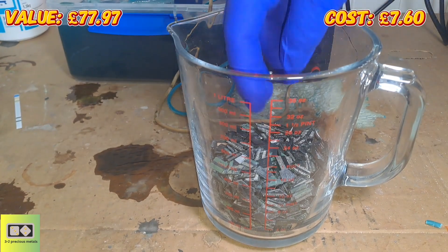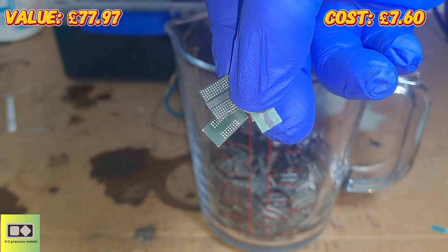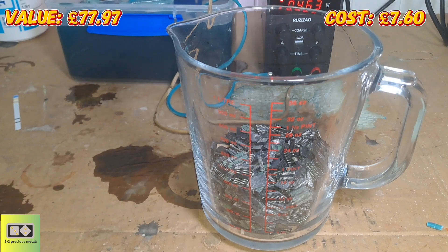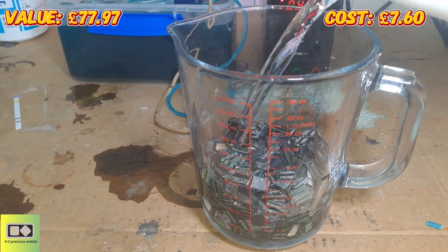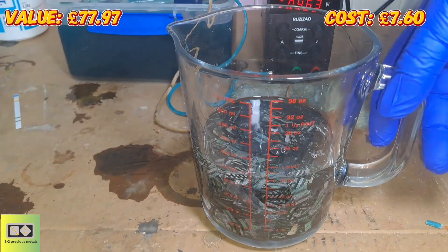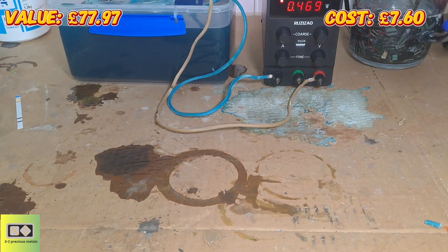I've got the BGAs here and I need to remove all of the solder, so I'm going to add some hydrochloric acid. I'm using hydrochloric acid that I've recovered from some copper chloride, so this is essentially free acid. I'll leave this to sit and dissolve all the solder and move on with something else.